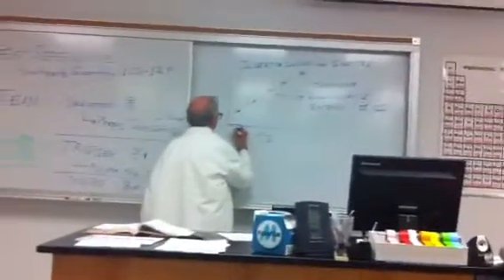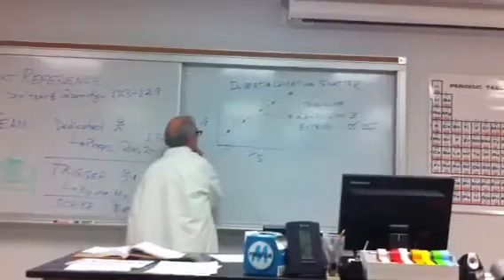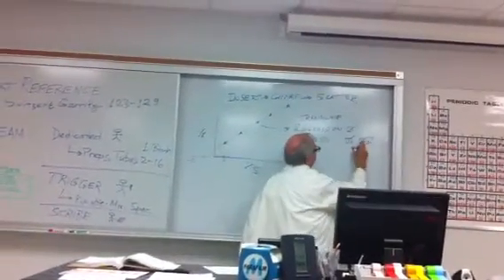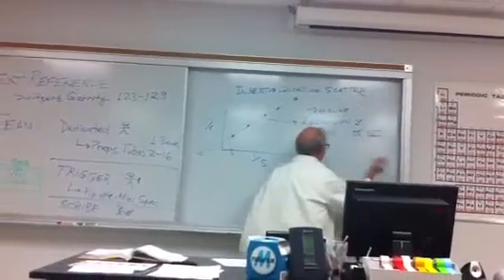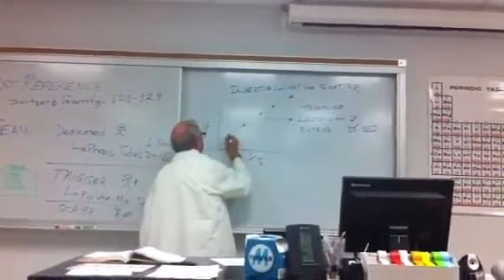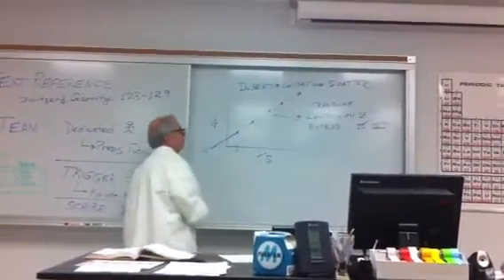So if you go back here, that was a 0.4 here. So you want to go back to -2 over here. Experiment around. You'll soon find out what we're talking about. Try 2, see what happens, and that way it'll draw the graph clear back down to here, which is what you want to see.